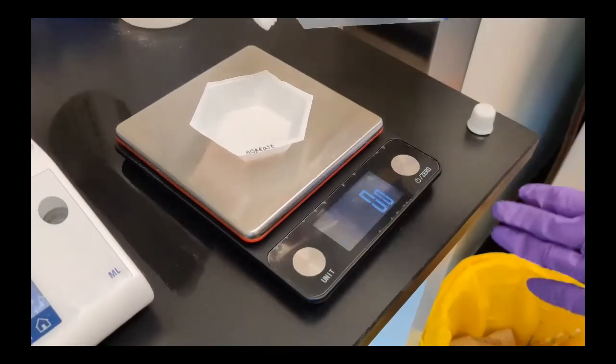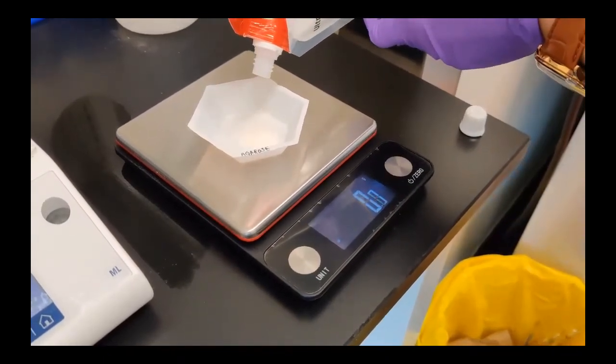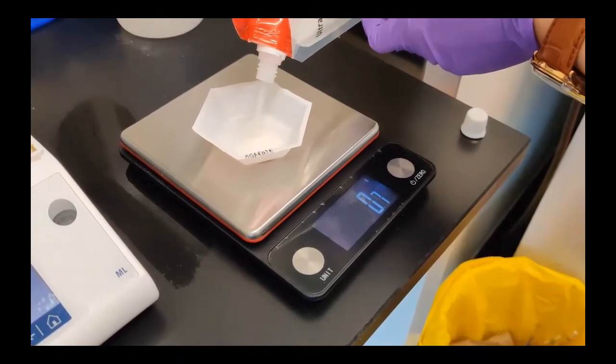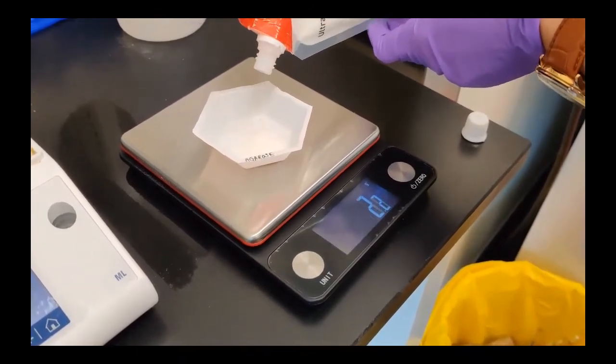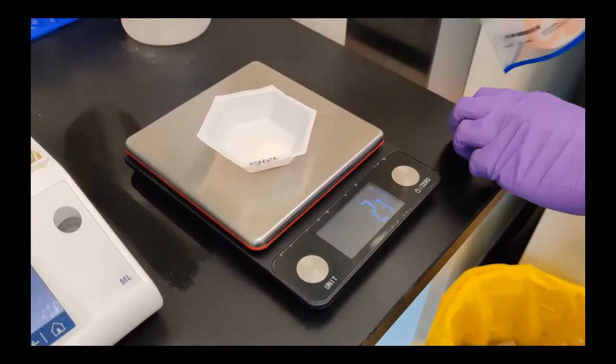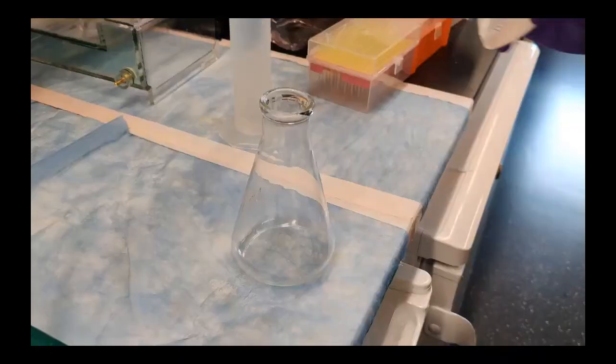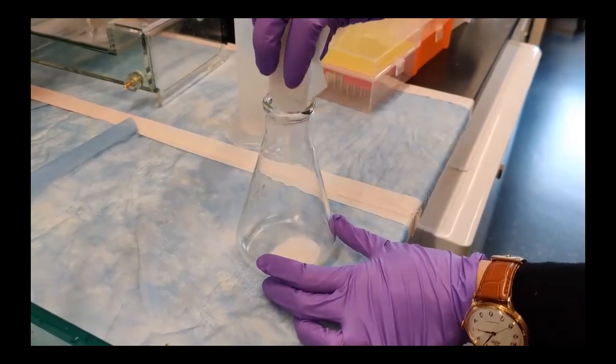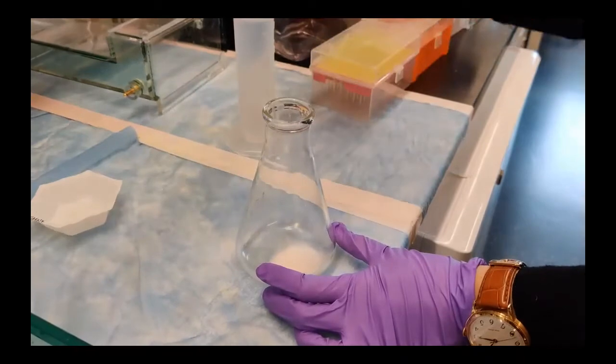To do this, first we must make the gel. This is sort of like making jello at home. We have to weigh out some of the agarose powder, which makes up the gel. We then put the powder in a flask and we add some liquid for it to dissolve in.